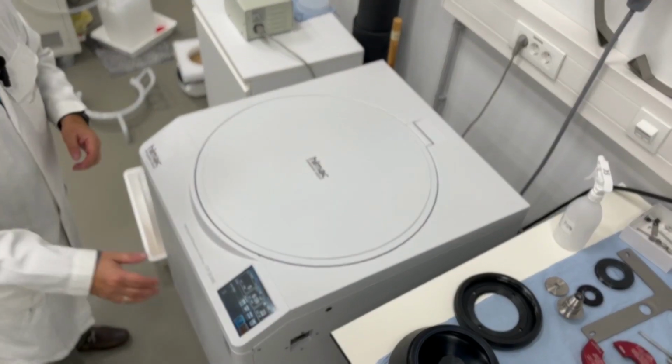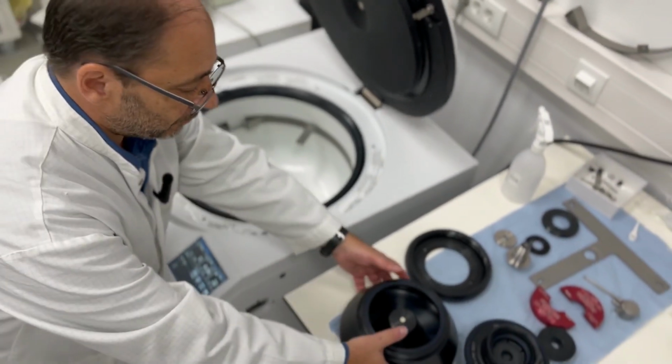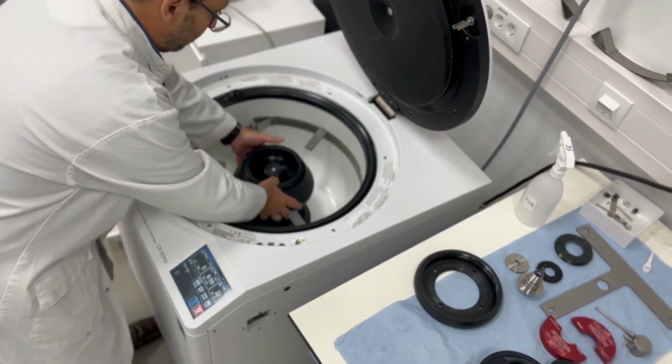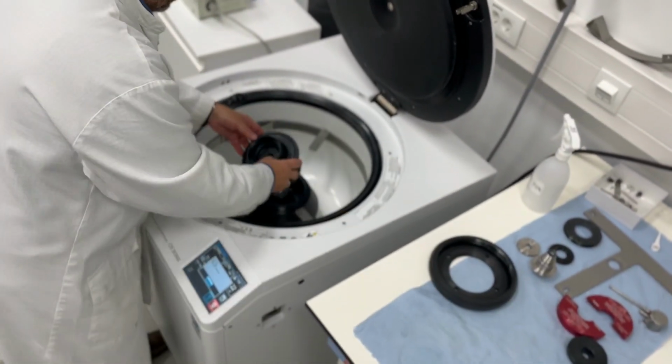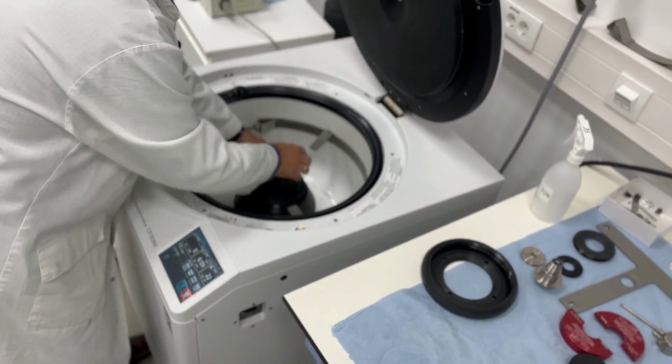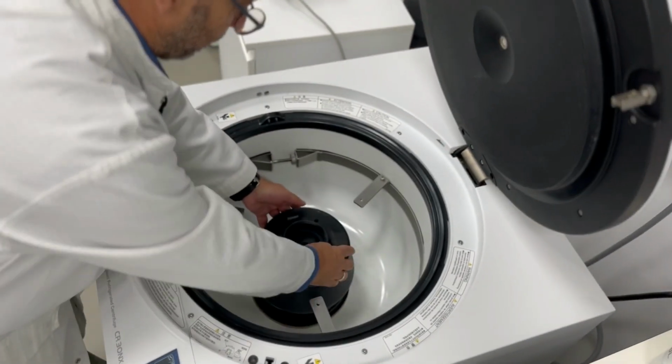Another common technique to separate cells from the surrounding media is to use centrifugation. During centrifugation, cells are exposed to forces that make them decant or sediment, creating again the possibility for us to obtain a completely clarified liquid that can be subjected to further processing, as we are going to see later on.